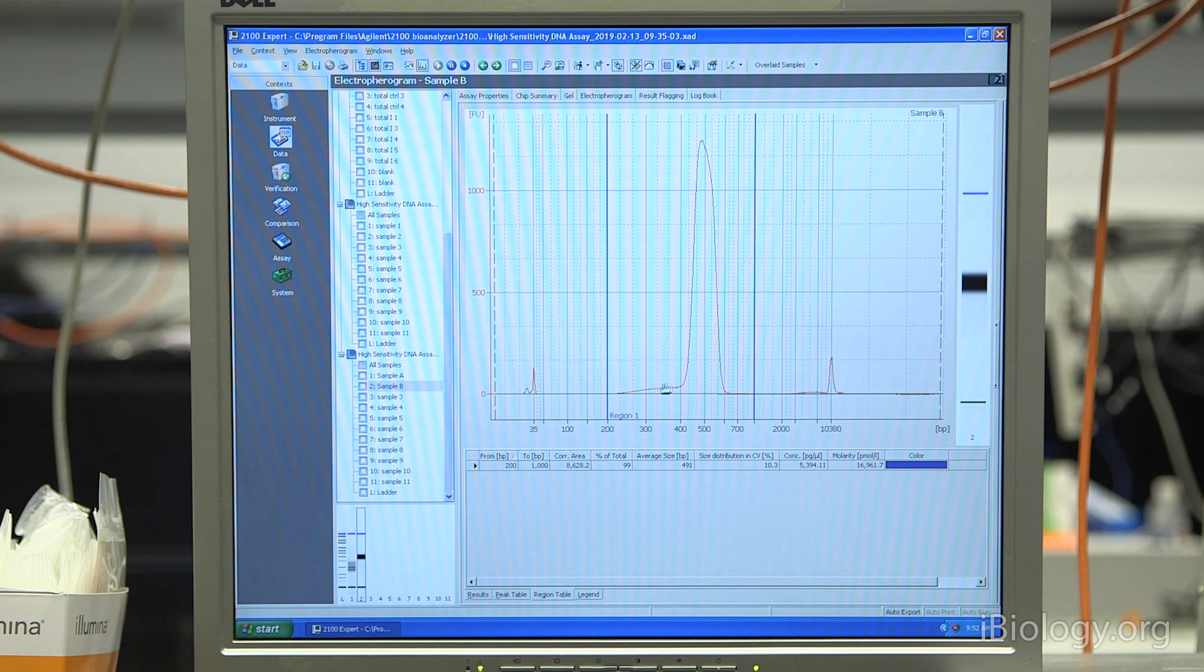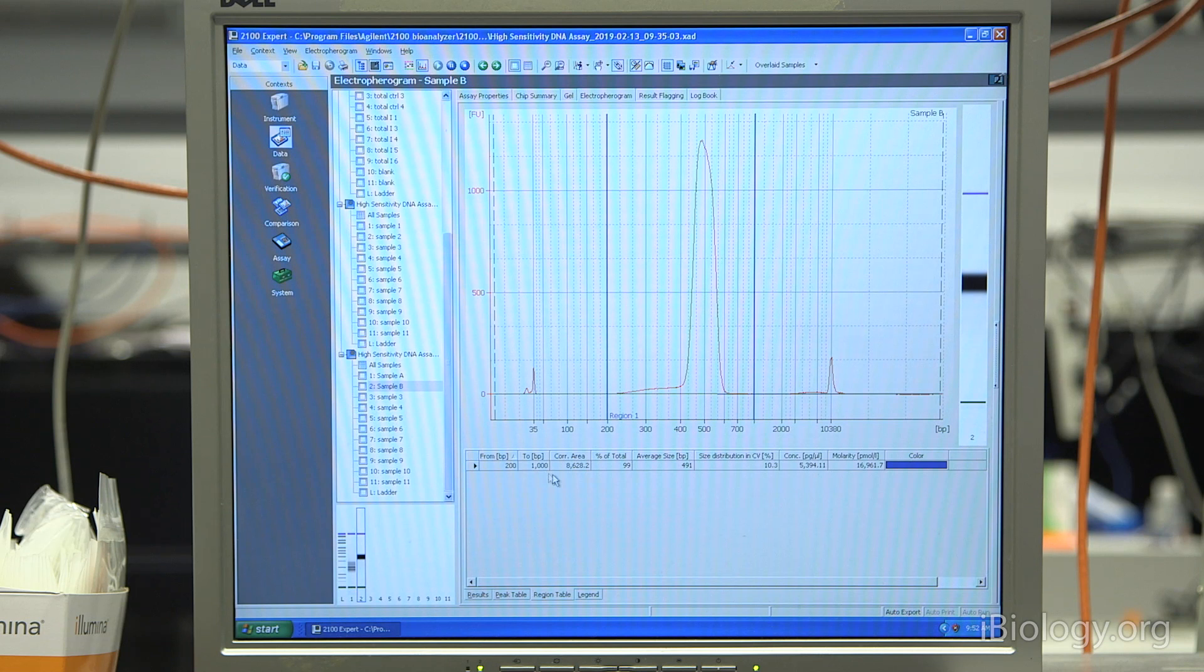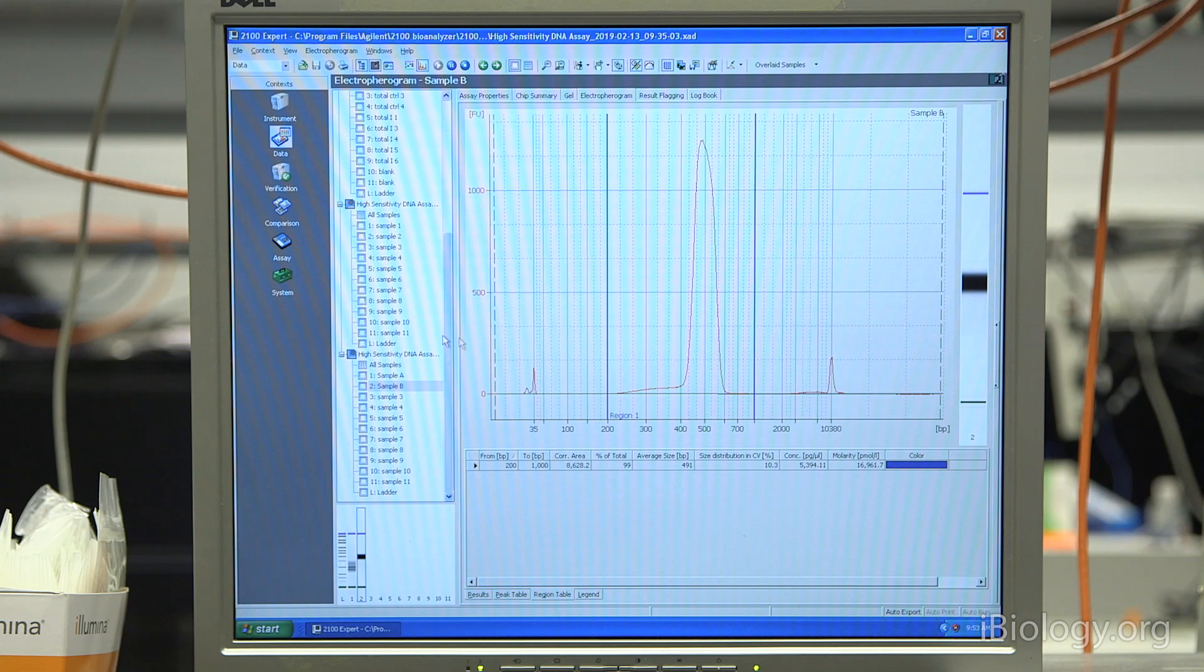Our other high-concentration sample is also being analyzed in this region. You can see that this is a much higher concentration library. This is measuring it at roughly 17 nanomolar. And the average size is 491 base pairs.